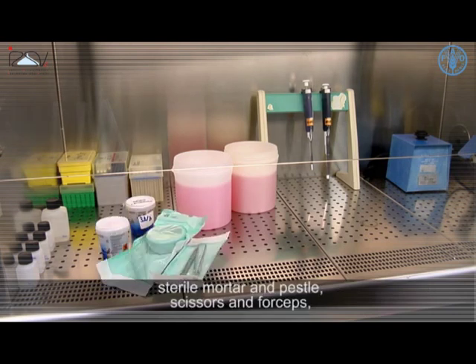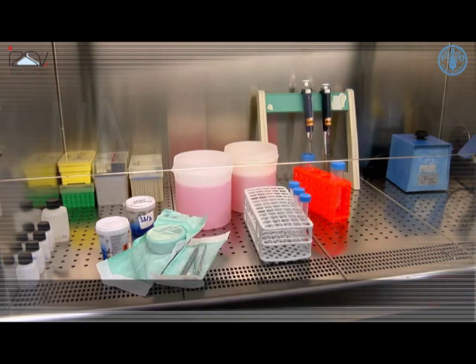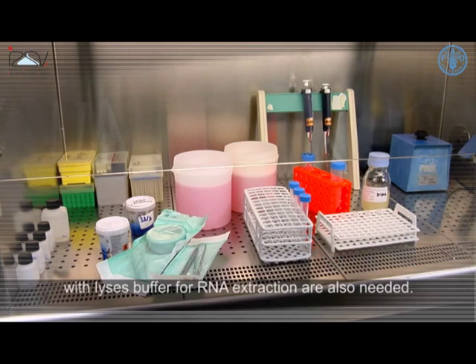Additional equipment includes a sterile mortar and pestle, scissors and forceps, tubes for sample storage, a second container to collect chemical waste, phosphate buffered solution with antibiotics, and Eppendorf tubes with lysis buffer for RNA extraction.